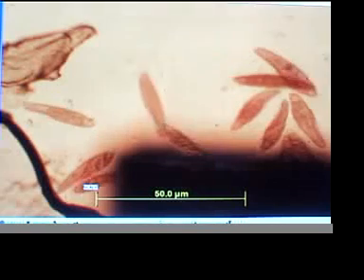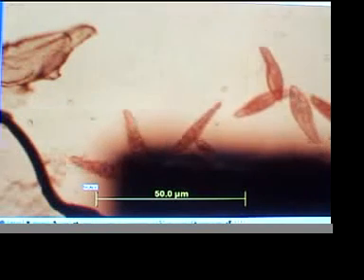Now, by the way, if you look at column A, there's 4A, 3A, and then a little before column A, look right on the numbers, 1, 2, 3. Can you see that? They're all over the place. They love this part of the slide. It's the furthest away from the plasma bulb on my extreme far right on the slide. See there? I'll show you that. They're all over the numbers.